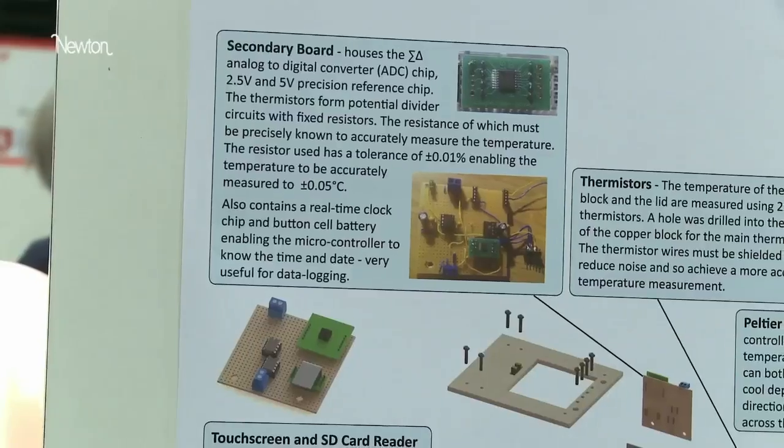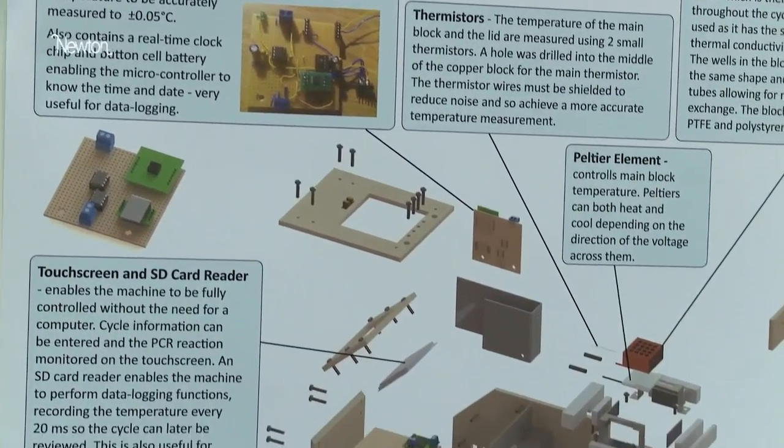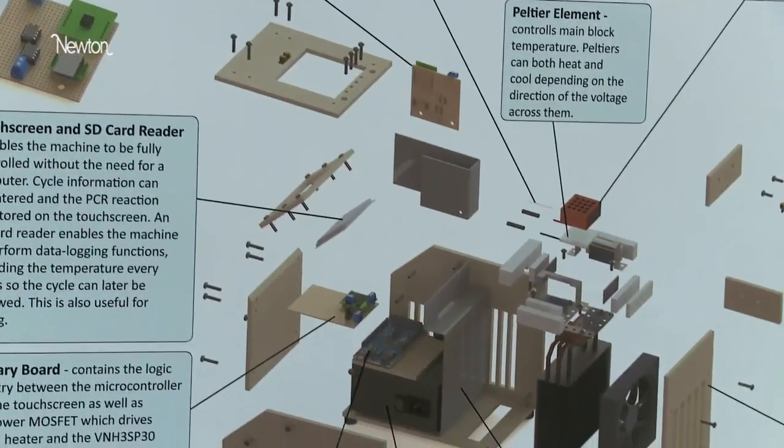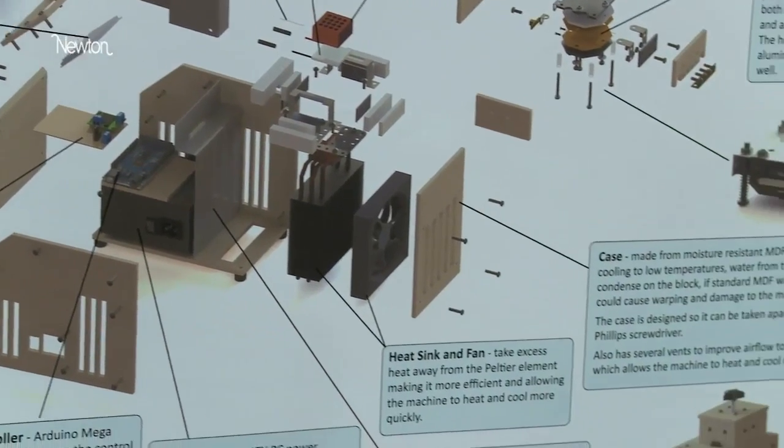So what my project is centred around is: can I build this equipment for cheaper? It's been a long project. I've put a lot of time into it — a lot of building circuits, designing circuits, building the case, planning how the heaters would work, as well as all of the biology side of it: how the experiments work, how the PCR machine copies DNA and how all that works.